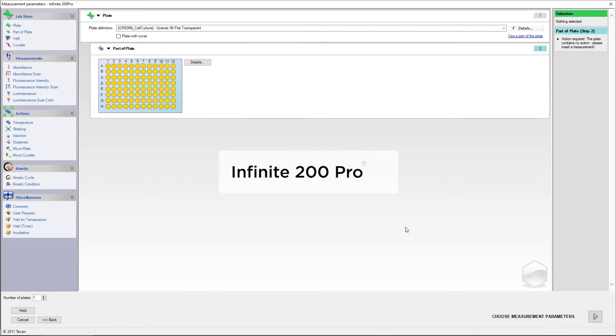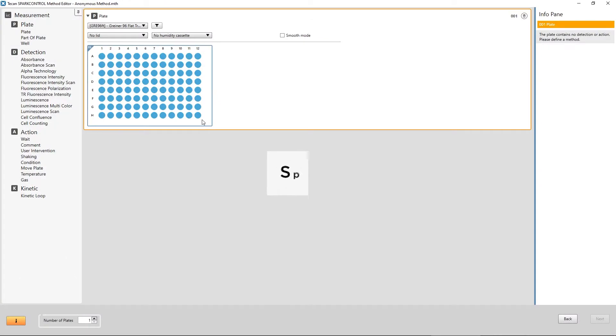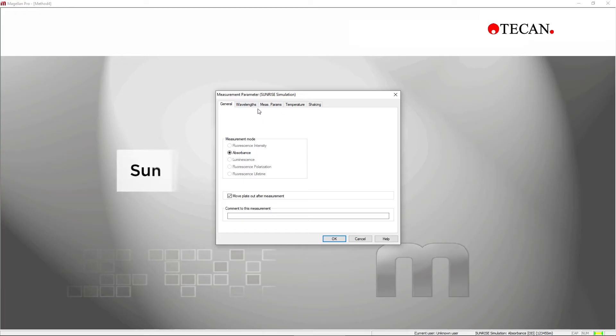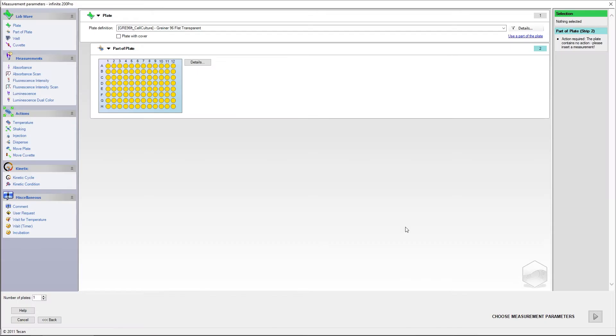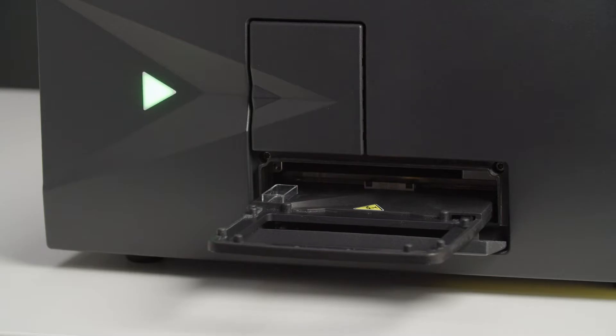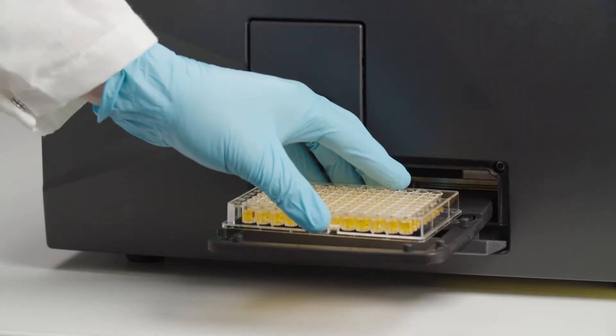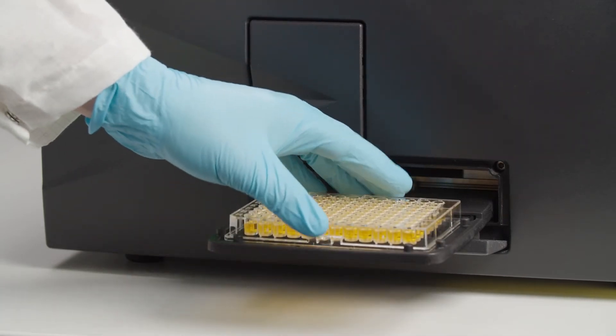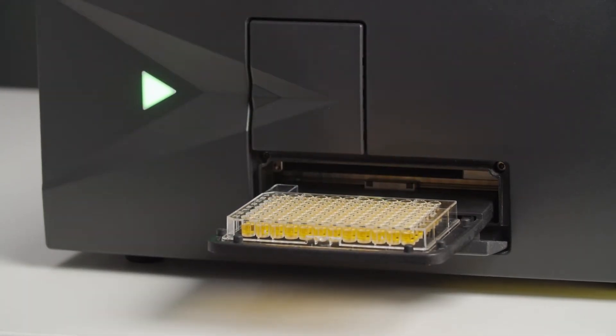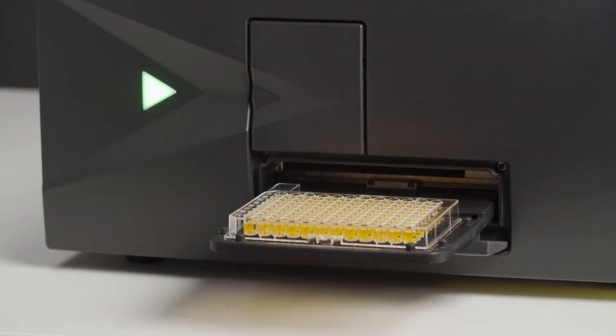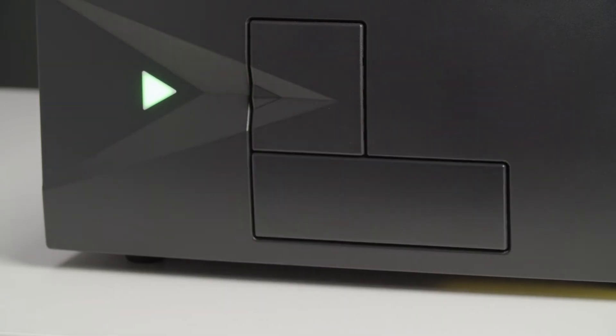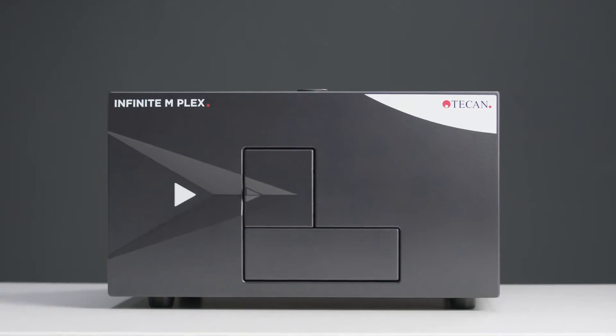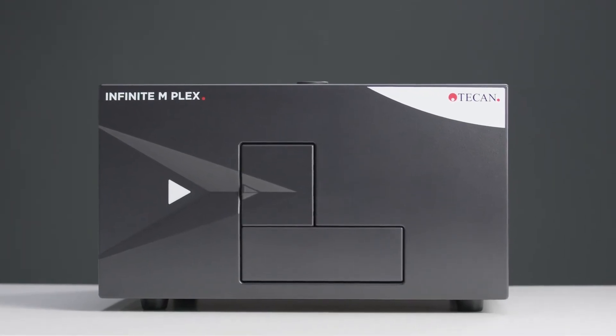Note that the measurement parameter wizard can look different depending on your instrument and its configuration. The manuals and installation tutorials will help you personalize your parameters in detail. In this video, we will guide you through the method setup on an Infinite 200 Pro. As a general example, we use data from a common assay protocol for the measurement.